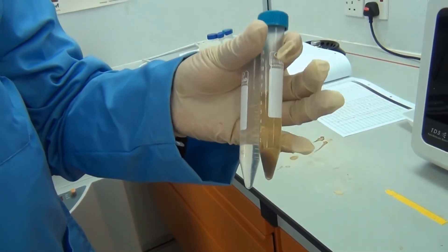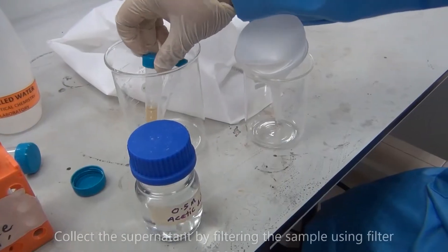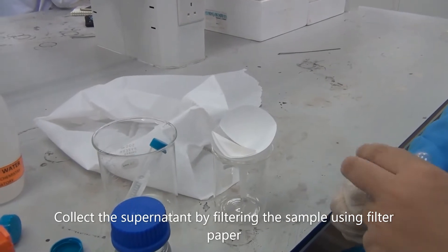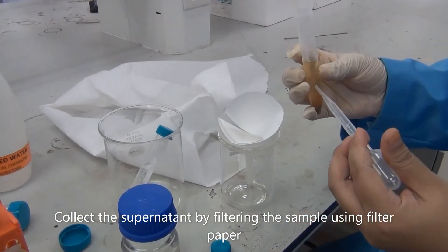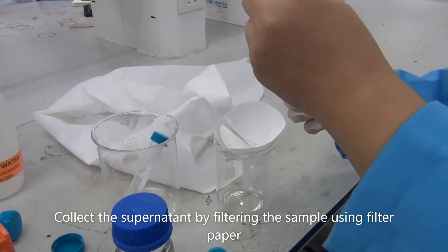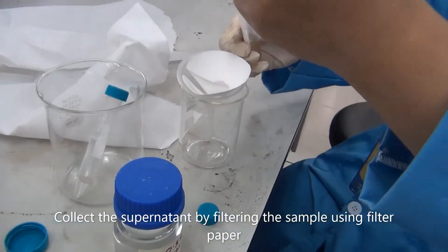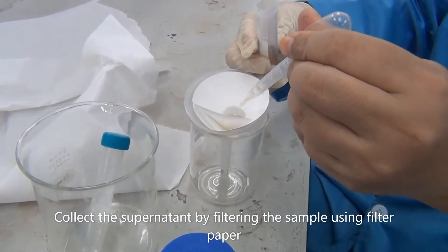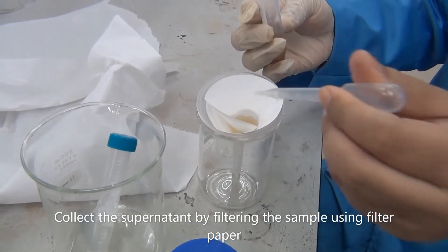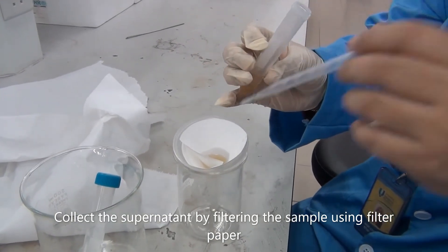This is the result after we centrifuge. And then we will filter — we collect the supernatant and filter it using filter paper. Only take the upper side. Please be careful: make sure that the residue is not mixed with the supernatant.